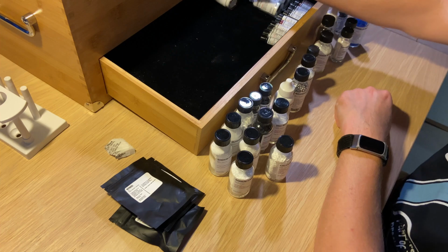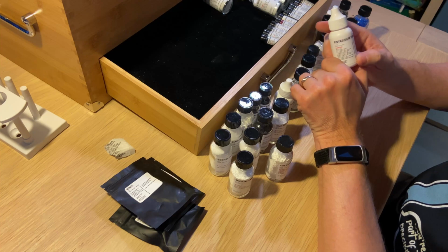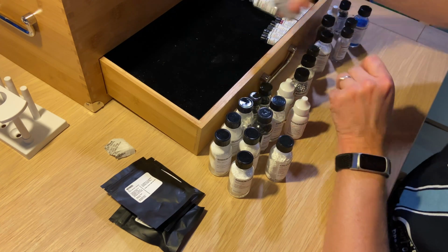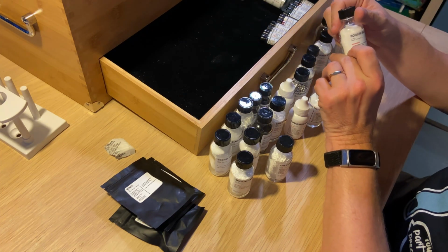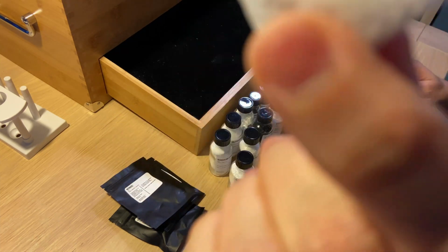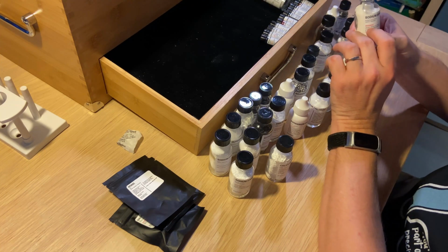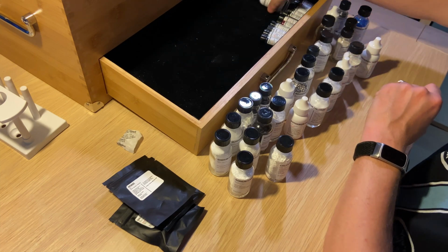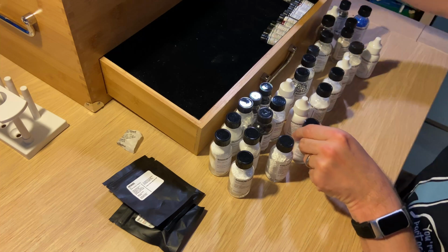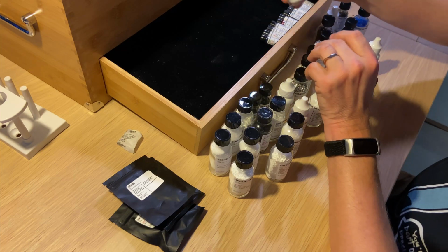It's all blue. Copper 2 sulfate. I've been spending a lot of time trying to search for that, besides this box. Potassium dichromate. We have ammonium chloride. And then we have sodium silicate. That's the one I was searching for. We also have it here. Same thing. We have glycerin. We have sodium borate. We have a universal indicator. We have trisodium phosphate. We have sodium thiosulfate. We have boric acid.